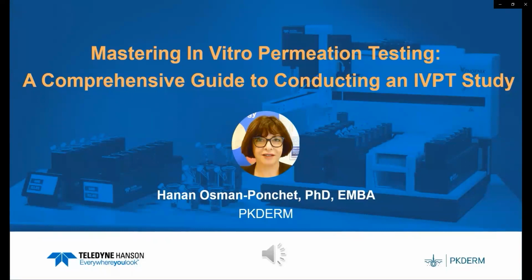So it has taken us longer than expected, but we have worked hard to prepare this very special webinar for you, which is Mastering In Vitro Permeation Testing, a comprehensive guide to conducting an IVPT study, where we will be addressing most of these questions. So today we'll dive deeper into the topic and cover everything you need to know about conducting an IVPT study, including videos and expert tips, and we hope that you will find it both informative and valuable.